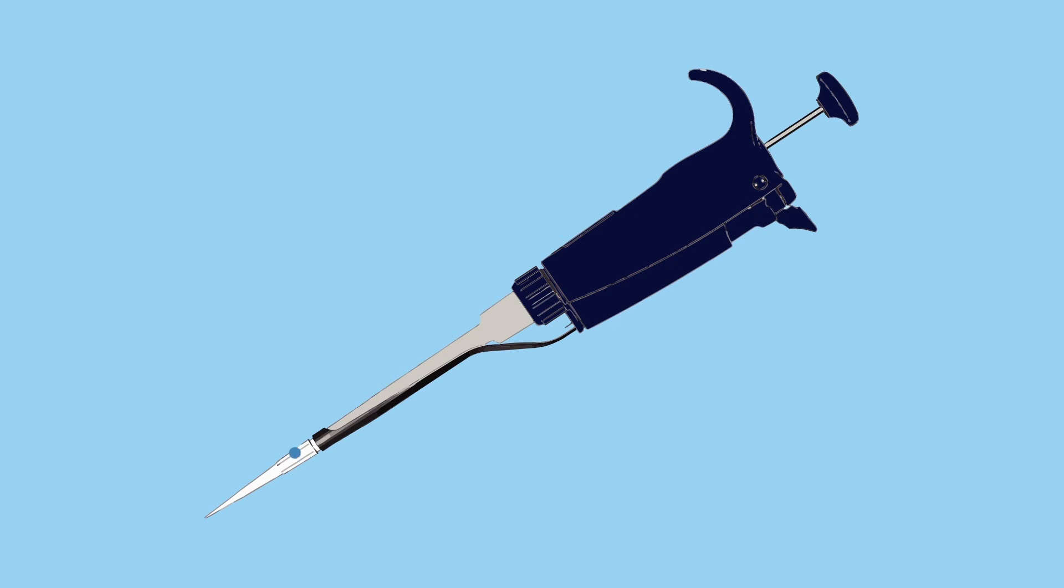This typically happens when you have a pipette that fits multiple tip sizes and select a tip too small for the volume dialed on the pipette. Filter tips are particularly valuable for sensitive applications such as PCR.